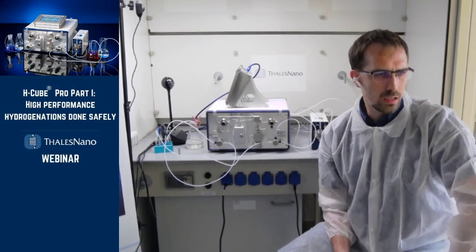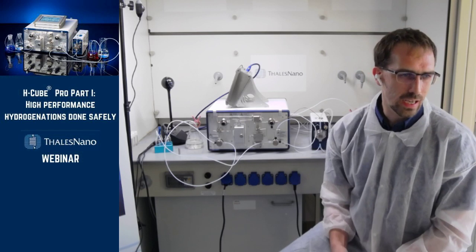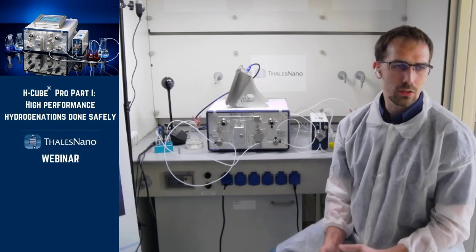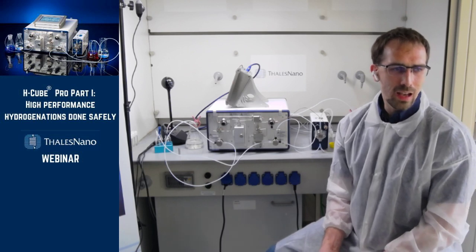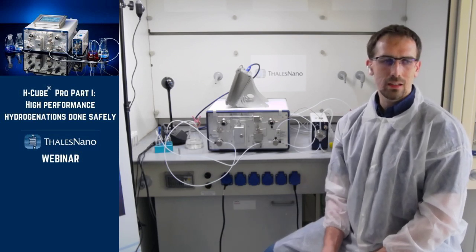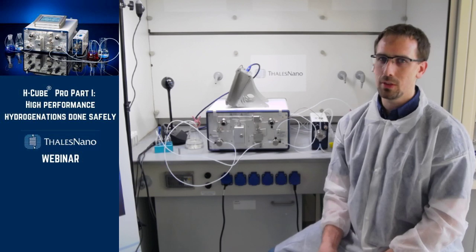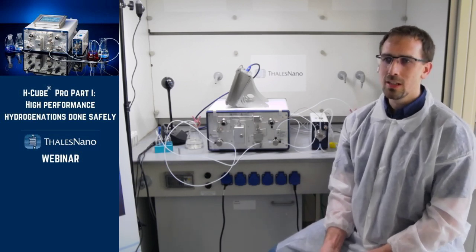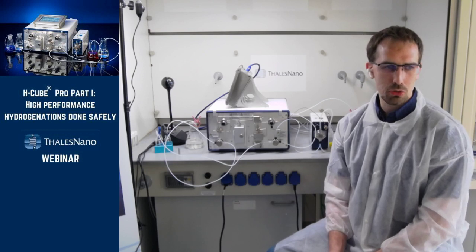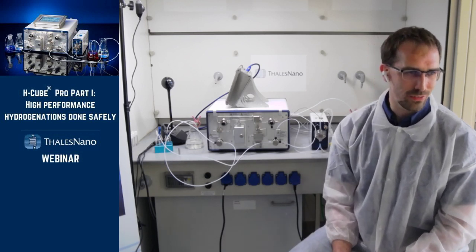The next question is about catalyst cartridge recycling. After the catalyst life is over, can we open one end and fill with new catalyst, assuming that we have the packer and sealing material? This is to avoid the expensive stainless steel cartridge. In principle, technically, you would be able to do that. I would not recommend it because the sealing on the other end can be damaged, contaminated as well. And I'm not sure about the pricing, but I would assume that the empty cartridges are not too expensive.